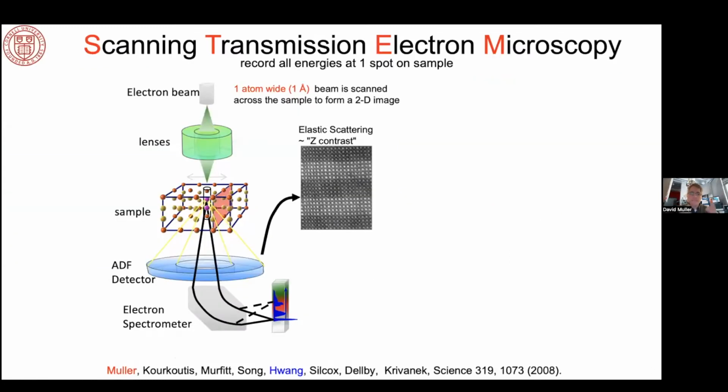So I'm going to start with a quick cartoon of an electron microscope, at least the way we run the microscope. In general, the idea is I use a very high brightness electron beam, and I can torment people about the brightness of these things: if you look at the sustained brightness, it's still higher than that of an XFEL. If you're looking at peak brightness, we can argue about whether it's better or worse. But in the time average sense of what you would need to actually record an experiment in a finite amount of time, we're definitely ahead.